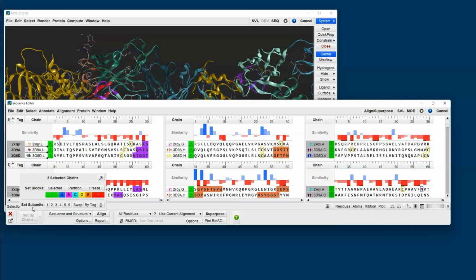In this case, the step was automatically done for us when we did the annotation of our antibodies. As I mentioned, the green asterisk represents the groups that are going to be treated as individual sequences and not grouped together with any other chains.